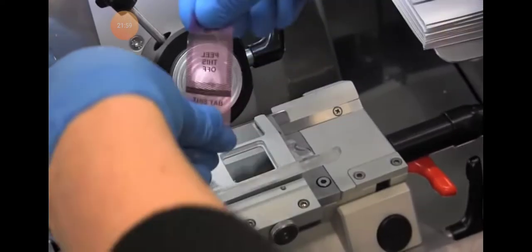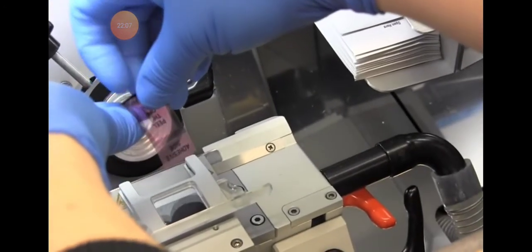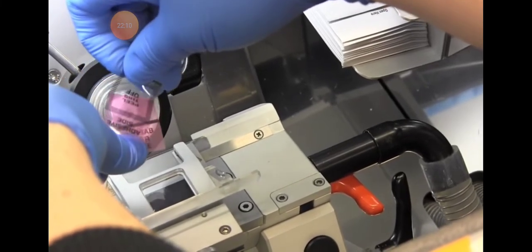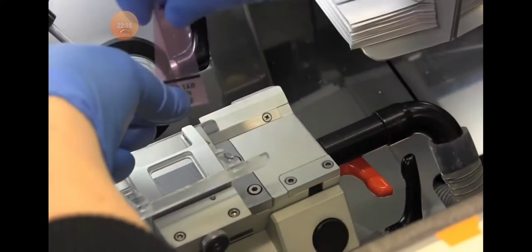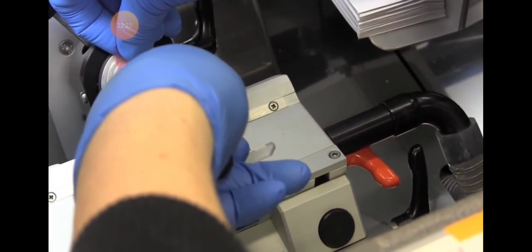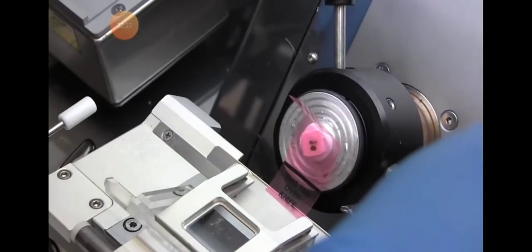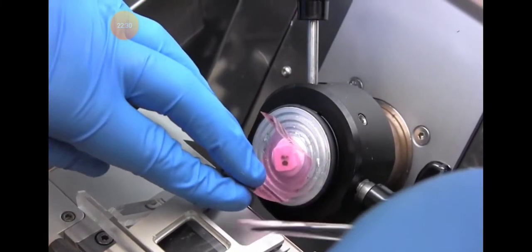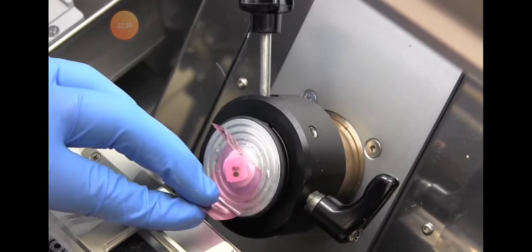Right. At this point, we're going to use the tapes that are specially made for the Cryo system. You take this tab that's over the knife, peel off the backing gently. If you peel really fast, it tends to curl. Peel it gently, throw away the rest, and put it over the knife like so, and then roll the tape on. Now to protect your fingers, usually I'll use the end of our brush to pick up the end of the tape so you don't put your fingers anywhere near the blade. It's very sharp. You don't know you cut yourself until it's too late usually.